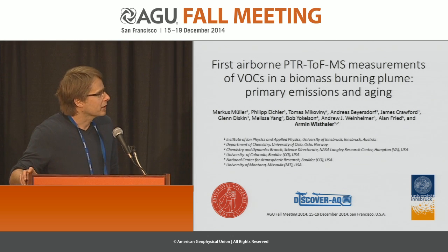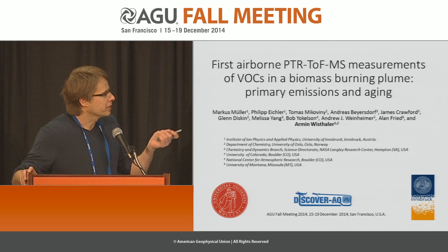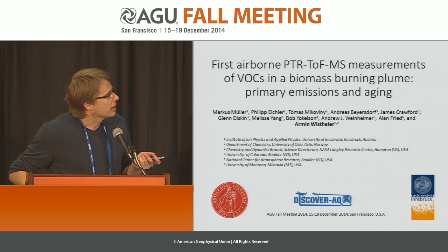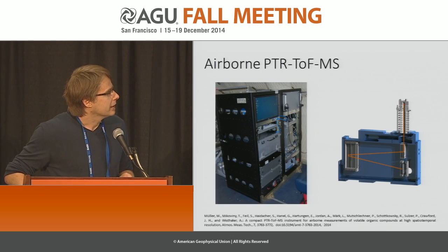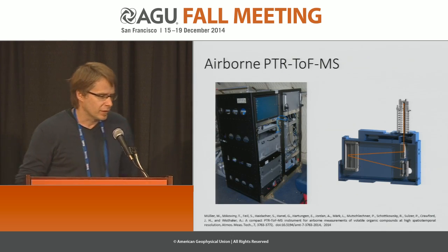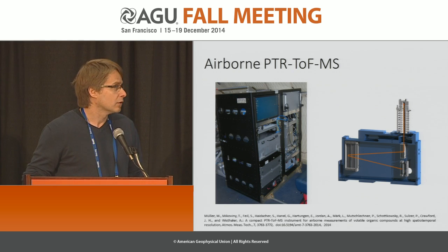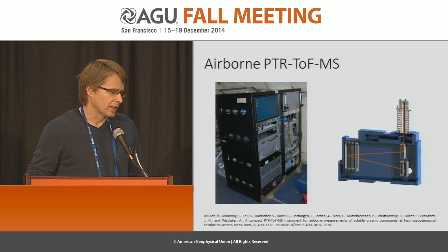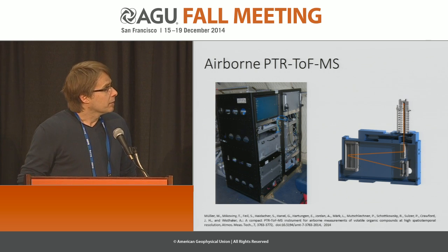So this is really work that was done by my colleague Markus Müller from University of Innsbruck, who can't be here, so I will be just presenting his work, and we have a lot of co-authors, which you can see here. So Chelsea has briefly introduced this nice new analytical tool, which is the PTR-TOF, and since early 2013, in the frame of the Discover AQ campaign, we are flying an airborne PTR-TOF-MS.